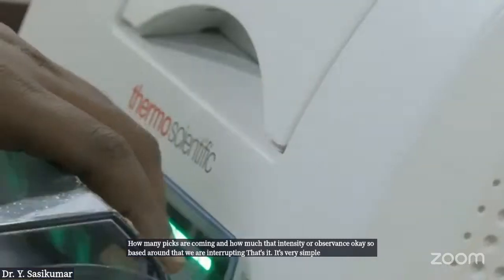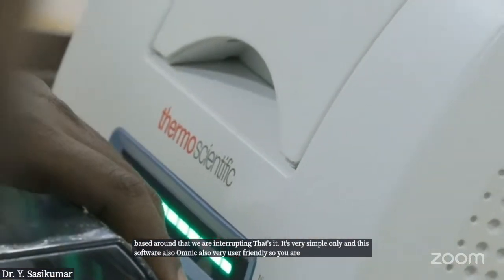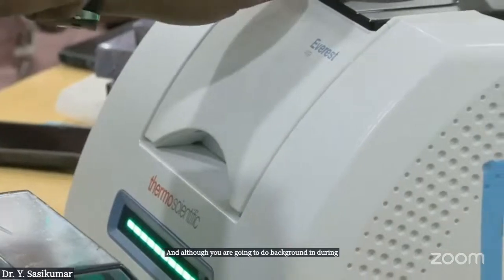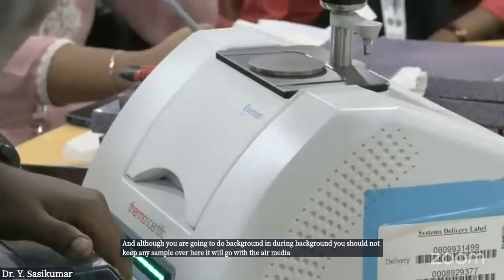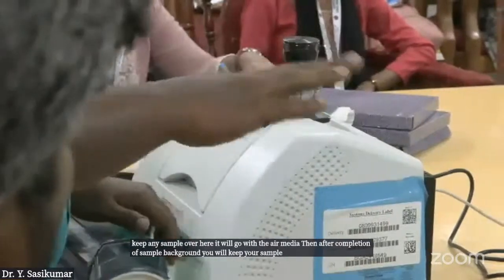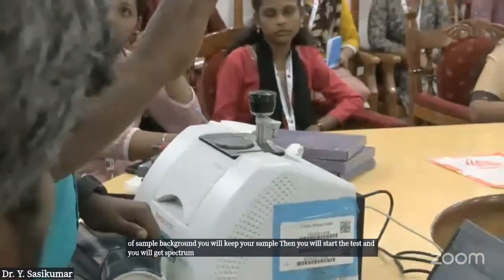And this software, Omnic, is also very user friendly. You edit your sample name, and you do the background. During background, you should not keep any sample over here. It will go with air as the medium. Then after completion of the background, you keep your sample, then you start the test, and you get the spectrum. That's it. Around 4 to 5 steps only.